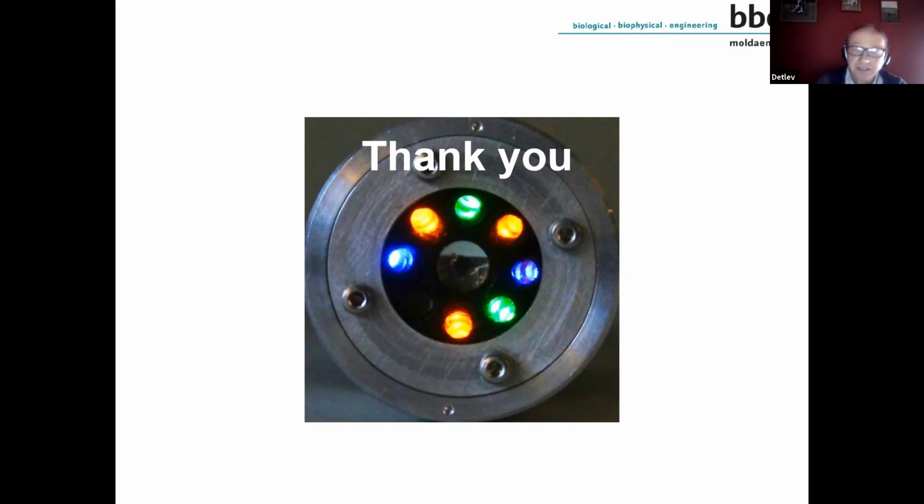So therefore it is suitable to perform this, but it's not that easy, because one measurement takes, let's say, about 10 seconds. And that means you have to wait until you are in a certain depth. We have another AlgaeTorch which is designed for 100 meters with a depth rating, and then you can measure also up to 100 meters using also these different steps.